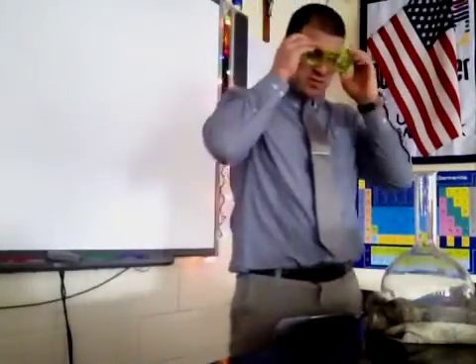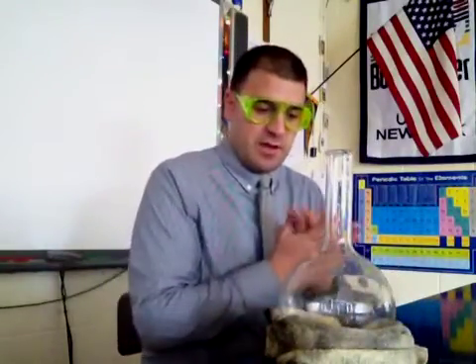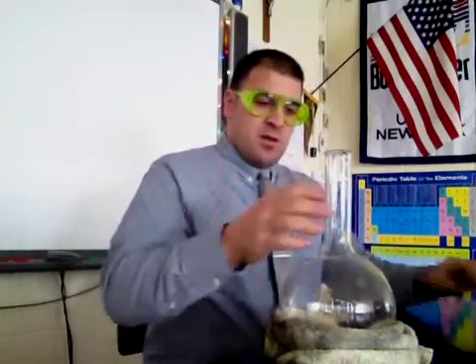Safety first. Please note I have extra pairs of goggles, but I do not have any more eyes in the back room. So here we go, starting off with a Florence flask.